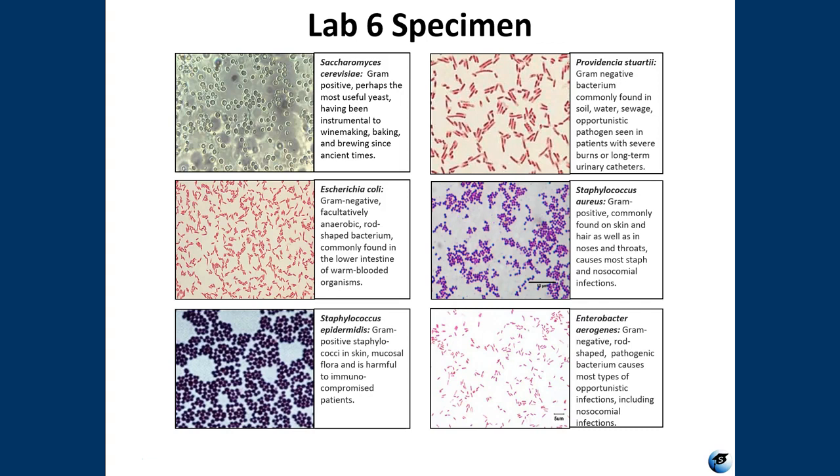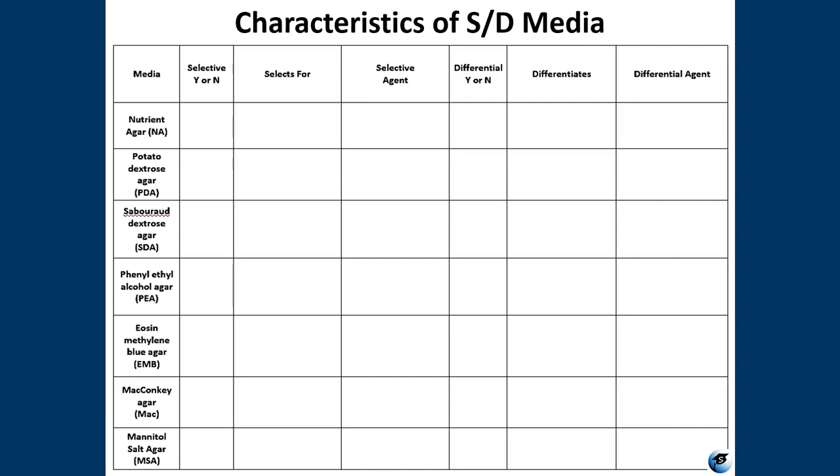So does E. coli ferment mannitol? Does Staphylococcus aureus ferment lactose? Those are the things that you're going to have to go and research on your own. I've given you guys this to kind of help you to keep track of all these media and what they do. So this is a table that you can fill out.